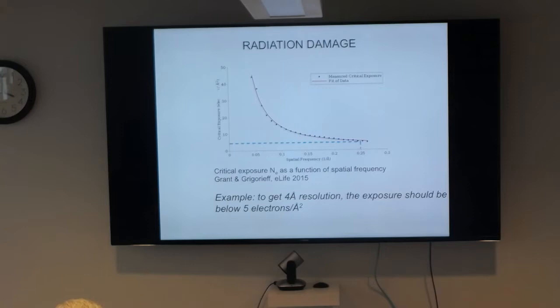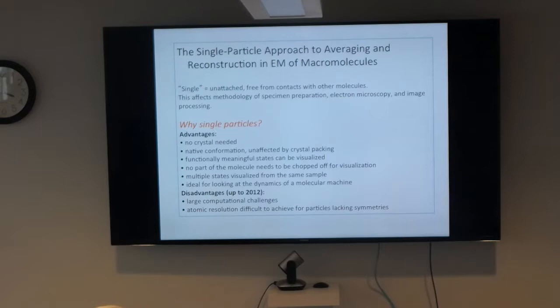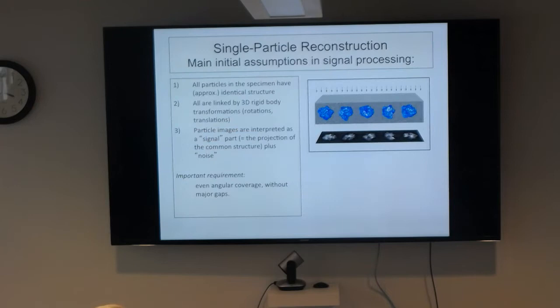So, single means unattached. It doesn't mean one only. Like singles in a bar. That's the concept: free from contacts with other molecules. I'm sorry.